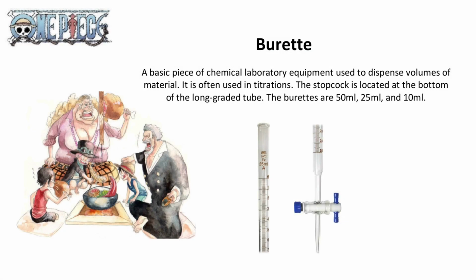Burette. A basic piece of chemical laboratory equipment used to dispense volumes of material. It is often used in titrations. The stopcock is located at the bottom of the long graduated tube. The burettes are 50 ml, 25 ml, and 10 ml.